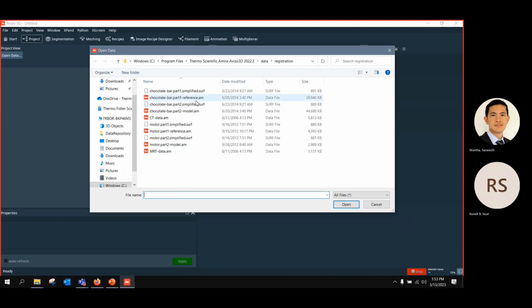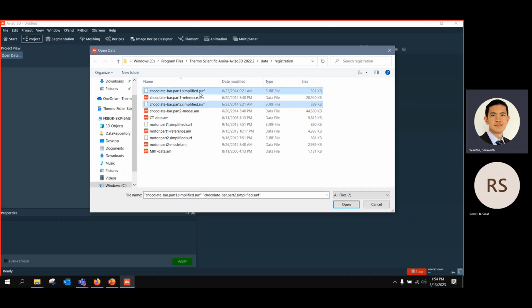Question. Yes. You have to overlay the two images like that for a big chunk. Is there a minimal overlay that the program needs? They don't have a minimum, but at least you have to have some part overlaying. The more you have, the better they can align. But if you have very little, then maybe it's not accurate. So try to bring them as close as possible. But if you don't have any overlap of the two images, it's not possible to register. And then, yeah, any questions?